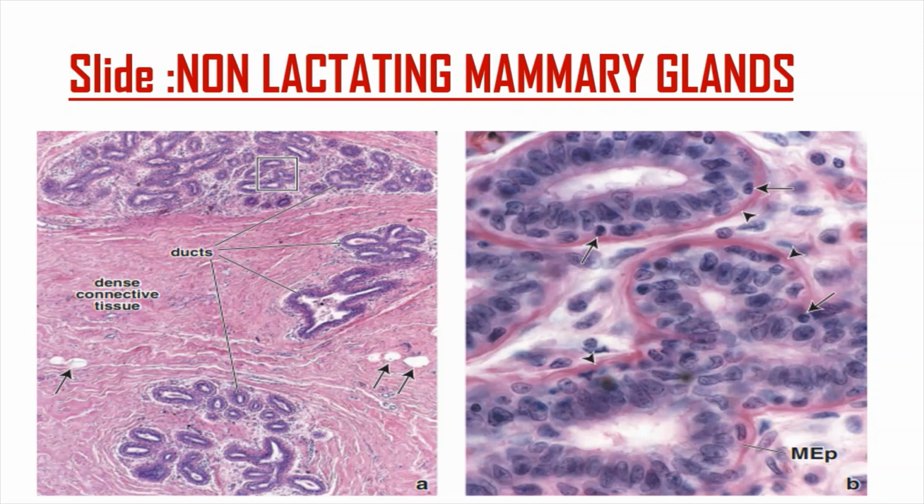how the gland is. So the gland is lined by stratified columnar epithelia or simple cuboidal epithelia. This looks like stratified cuboidal epithelia, and it has a lumen here. You see that in the lumen there is nothing, meaning it's not producing anything. There's no mucus here, so it's non-lactating. The lumens here are empty, non-lactating. So for the breast, make sure you draw a lactating breast at high power and low power, and a non-lactating breast at low power and high power, using these images that you're able to see.